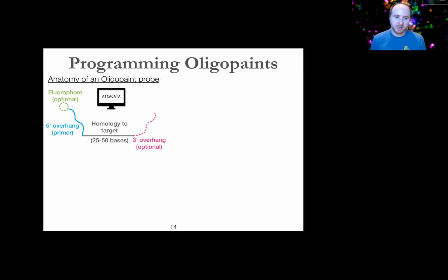And then you also potentially can encode overhangs deliberately into your oligos as well. So for instance, you can make a binding site for what we sometimes call a secondary oligo that works very analogously to how a secondary antibody would work. And our ability to control at a base pair level the full sequence of each probe in our library really is what's opened up, I think, a lot of cool engineering avenues in terms of pushing what FISH technology can do. So I'm highlighting a few of these here.